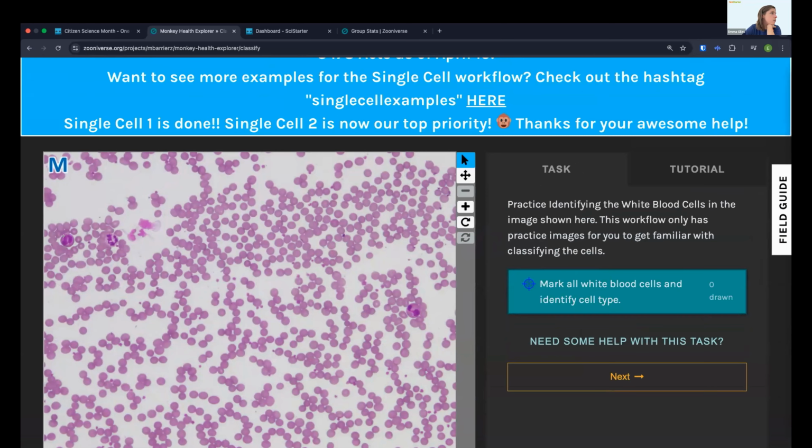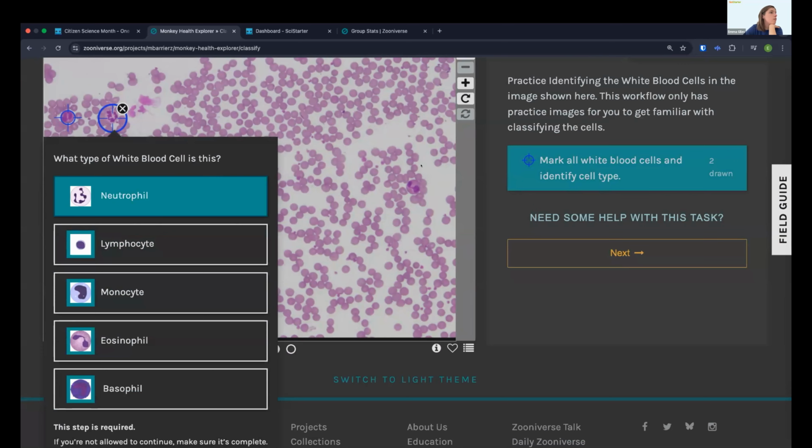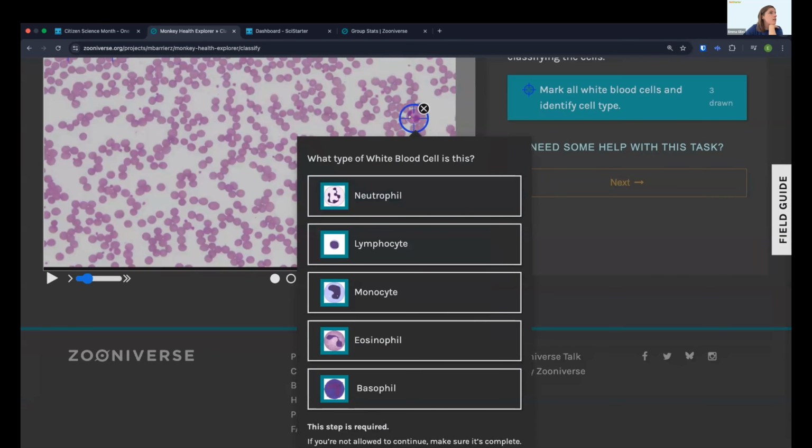Let's look at this one. All right, so this one's a C shape of some sort, which is goofy looking. Looks like it could be eosinophil. Looks like it could be a monocyte. I'm thinking eosinophil. Over here, this is a very complex silliness. Too many little pieces. This one over here has got 2 sections, so I'll do eosinophil for that as well.